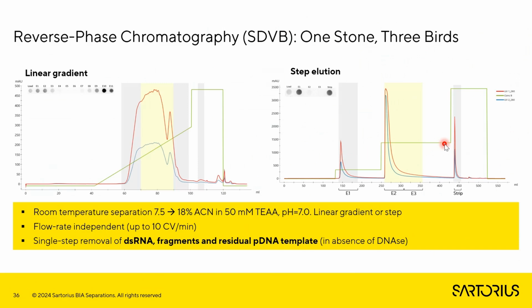And so the way we deal with that very reliably is by the use of ion pair reverse phase chromatography, first postulated by Katalin Karikó all the way back in 2013 as being very effective, and indeed it's super effective. It's also very scalable, and we've been developing approaches for both mRNA and self-amplifying RNA in depleting the RNA of the double-stranded RNA impurity.